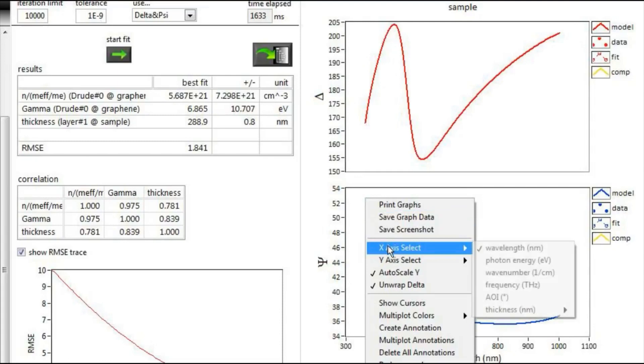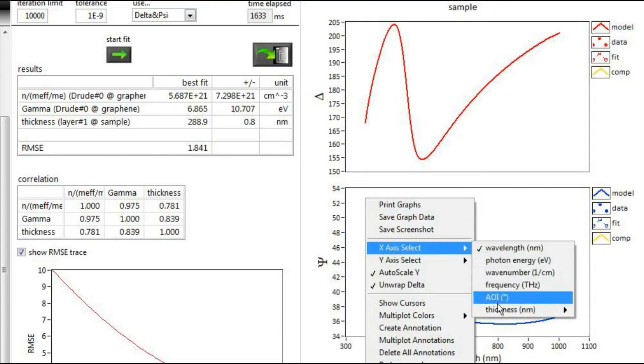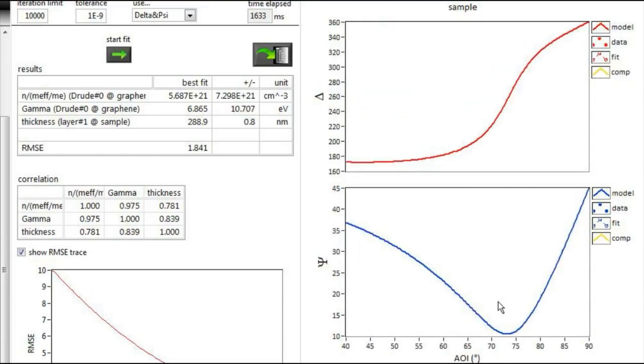The simulations can also be displayed as a function of wavelength, angle of incidence, or other variables.